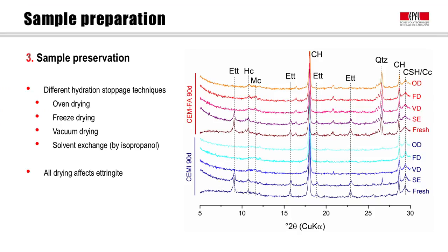The results of a round robin test on hydration stoppage clearly show that none of the hydration stoppage methods leave the hydrate assemblage entirely intact. In particular, ettringite and AFM phases are affected by drying. Oven drying, freeze drying and vacuum drying result in the removal of structural water and thus the decomposition of ettringite and AFM phases. Oven drying was observed to be more destructive than vacuum drying, and it appears that all direct drying methods result in the dehydration of cement hydrates. In case of crystalline products, this may lead to decomposition and an underestimation of the phase content in hydration-stopped samples.